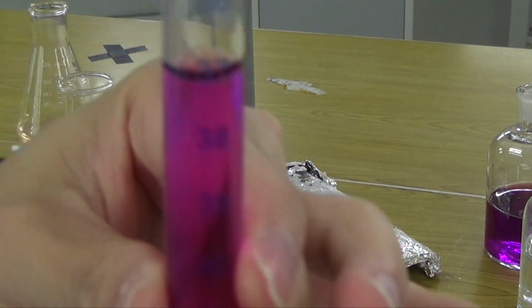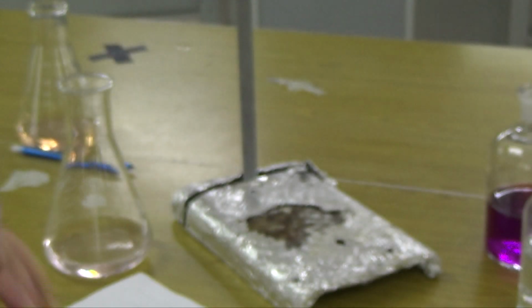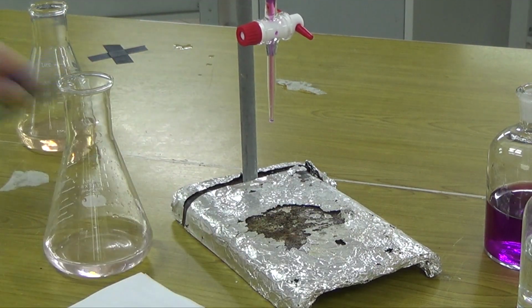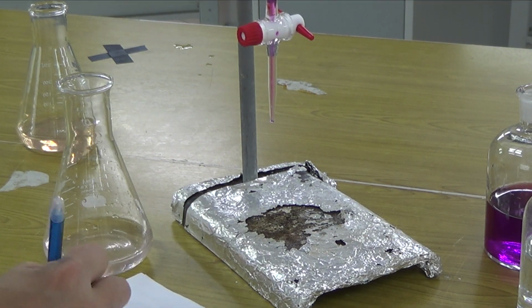So I'm pretty sure what I've gotten previously was quite accurate already, but this one is just 36.7. So I'm going to put it at an angle a little bit, so 36.7 there. So just now I got 36.5, 36.7, so still pretty close. I'm just going to take note of it somewhere, just so that when I do my exact titration later on, then I can think about what is going on.